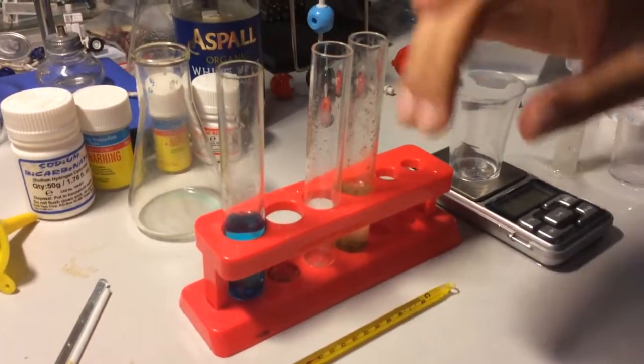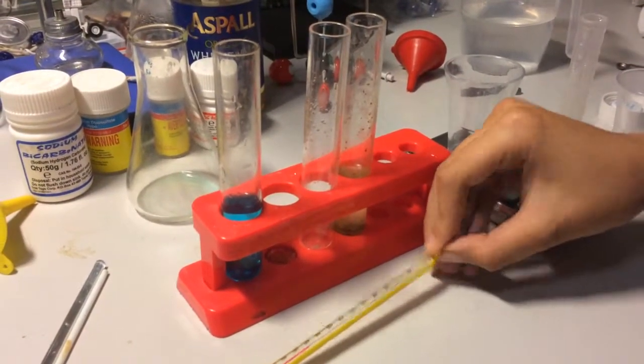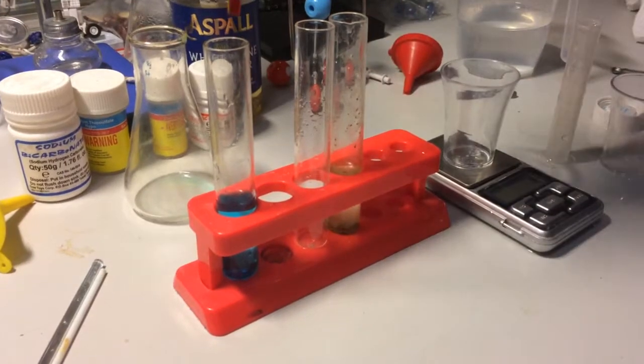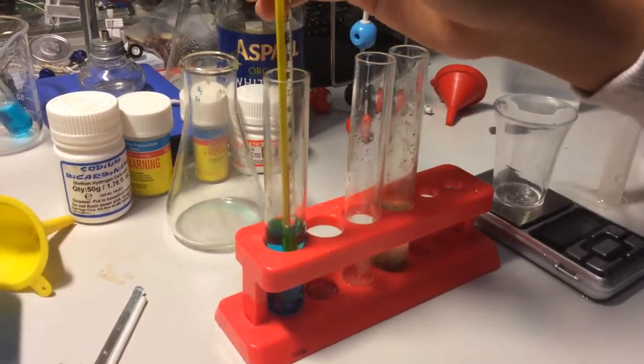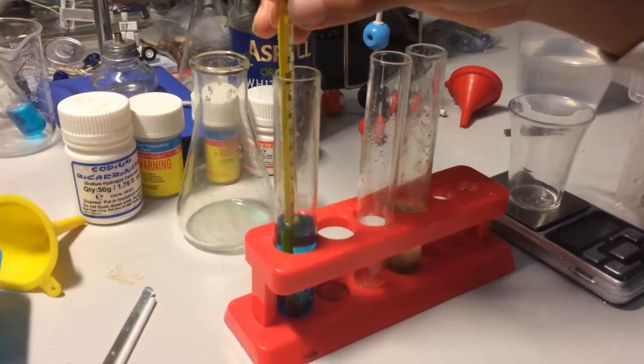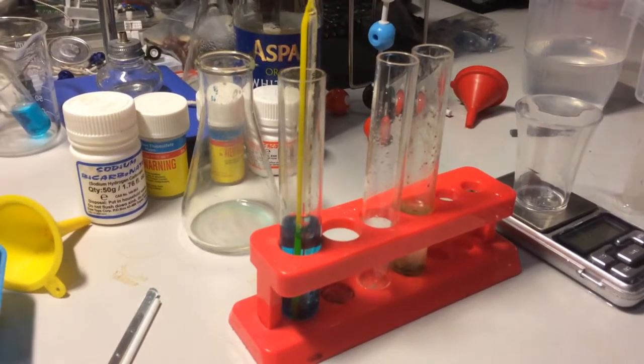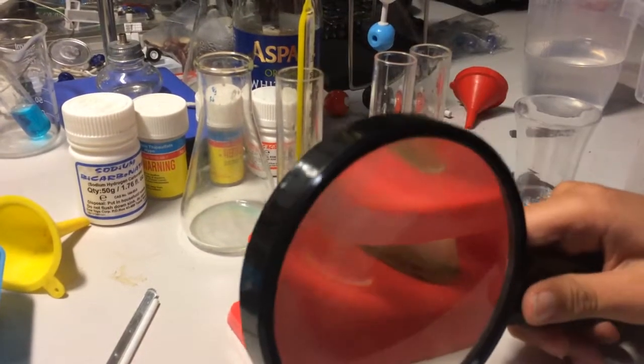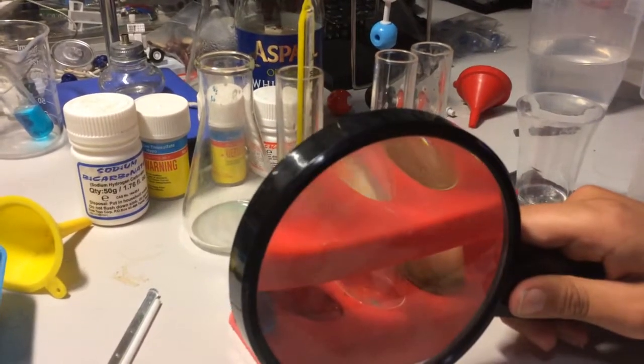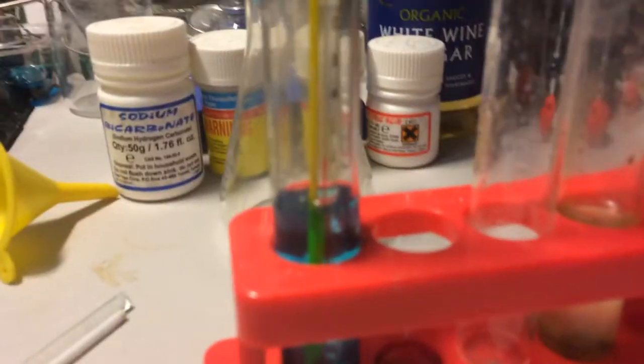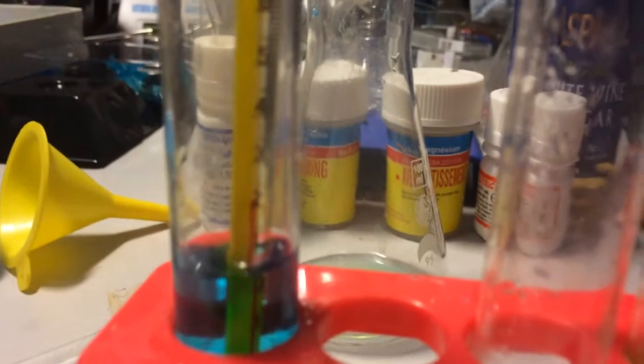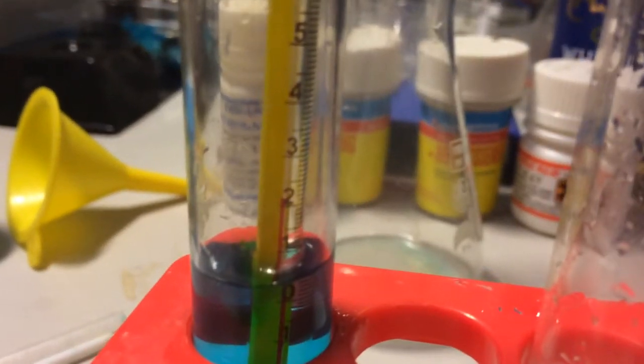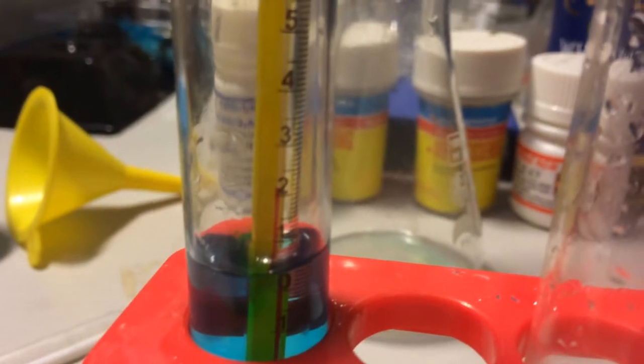Before we add the iron, we will need to measure its temperature before and after the reaction to see if it is an endothermic or exothermic reaction. As you can see, the temperature here is around 21 degrees. If after the reaction it goes up, it is an exothermic reaction. But if the temperature goes down after the reaction, it is an endothermic reaction.